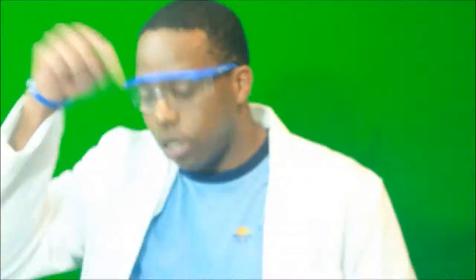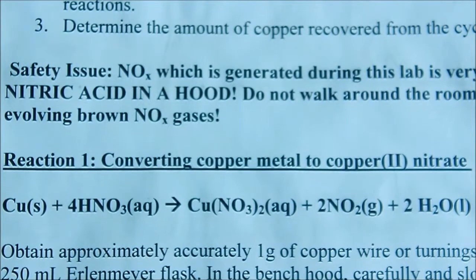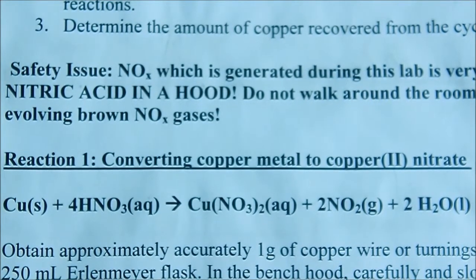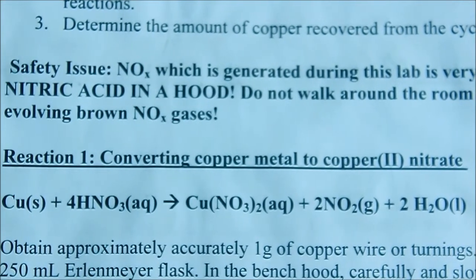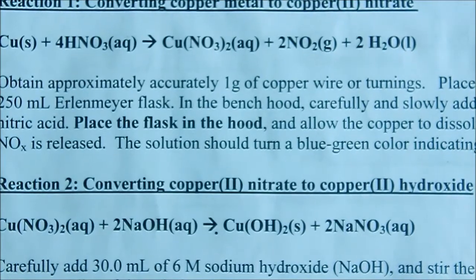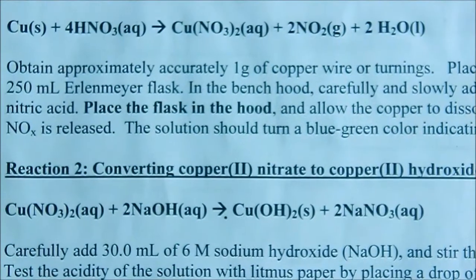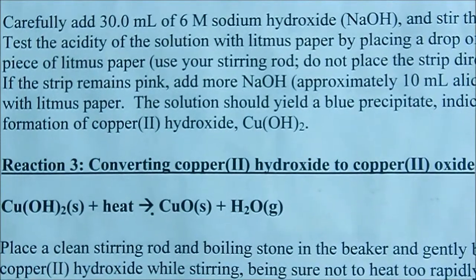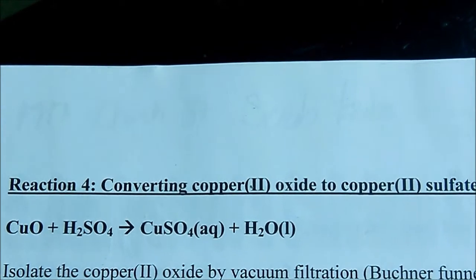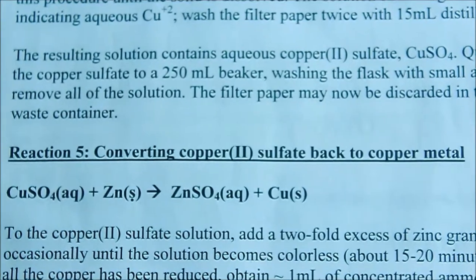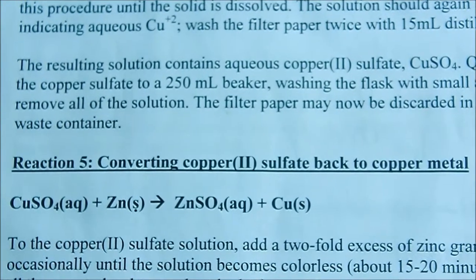Add the Nitric Acid under the hood. Now convert Copper Metal to Copper Nitrate. Then Copper Nitrate to Copper Hydroxide. Then Copper Hydroxide to Copper Oxide. Then Copper Oxide to Copper Sulphate. Then Copper Sulphate back to Copper Metal.